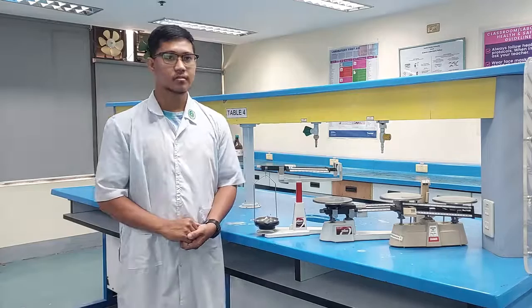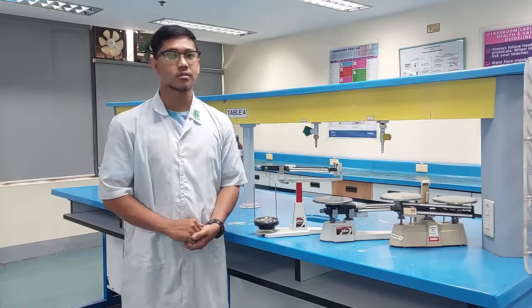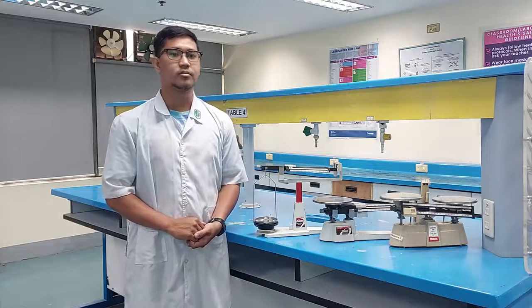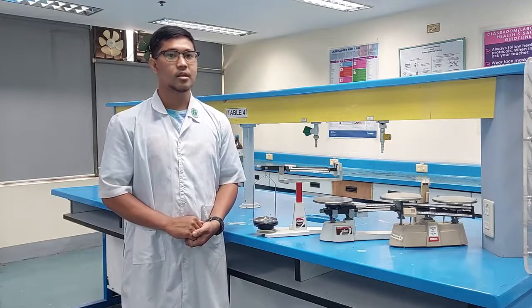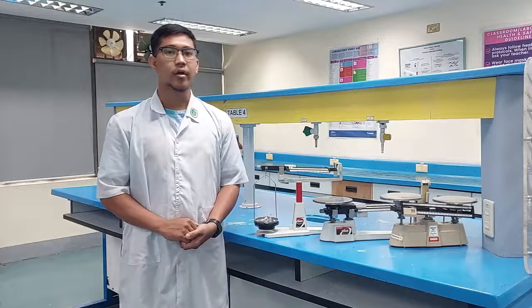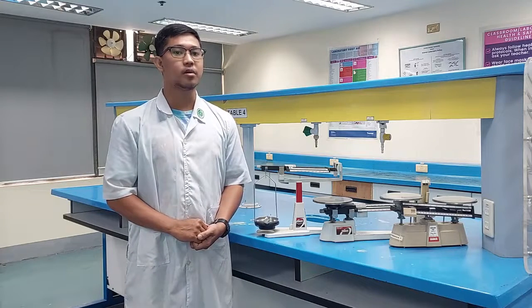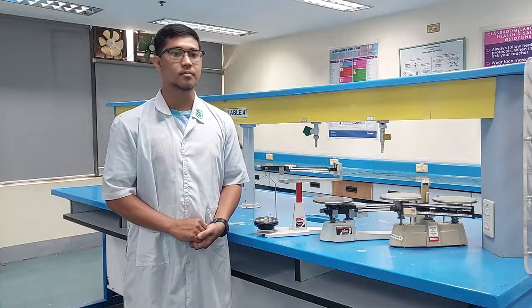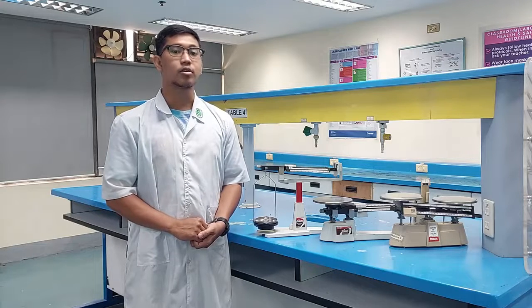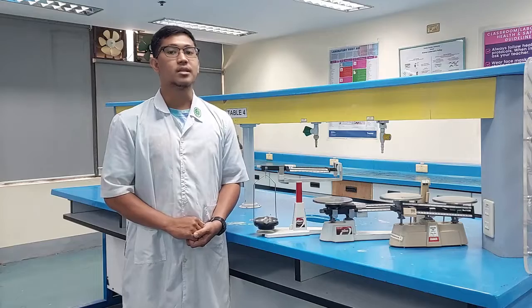In order to protect the balances and ensure accurate results, a number of rules should be followed. Always check that the balance is level before using it. Never weigh directly on the balance pan. Always use a piece of weighing paper or weighing vessels to protect it. Do not weigh hot or cold objects. Clean up any spills around the balance immediately.